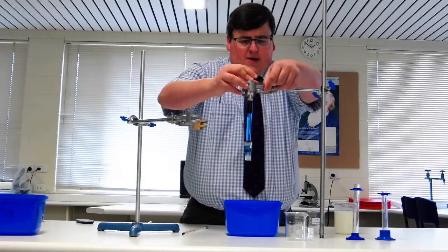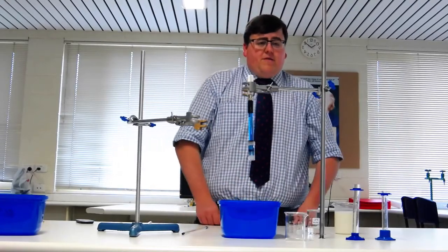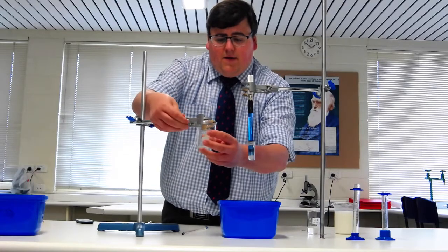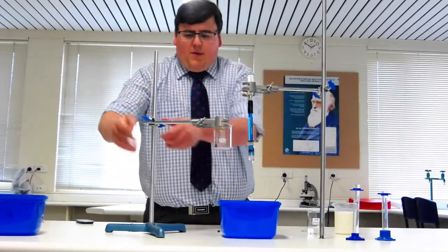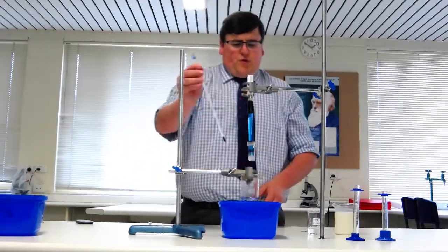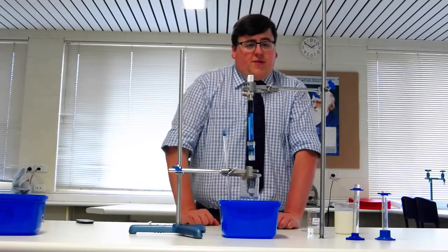Put the wireless probe into the retort stand — not too strong because you don't want to break it, just enough to grip it — and that should be right above the water bath. You're then going to put your empty beaker into your other retort stand and clamp, not too strong. Lower it so it's just over the water bath. Make sure the water bath is around 37 to 40 degrees, which is the optimum temperature for lipase. Keep the thermometer in there so you can keep an eye on it throughout the experiment.